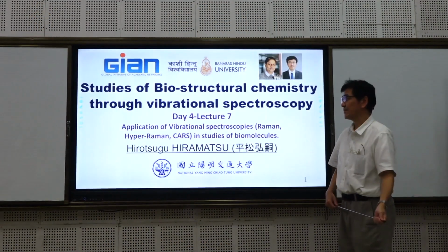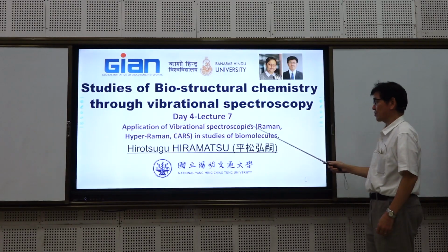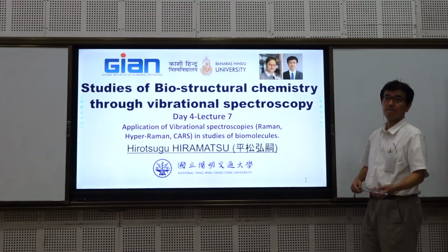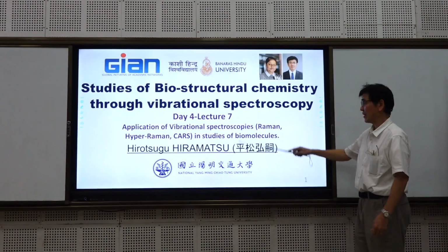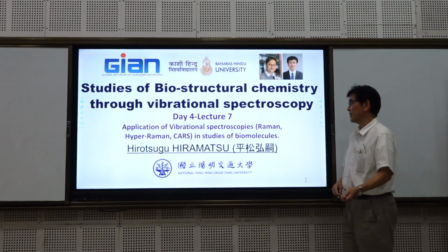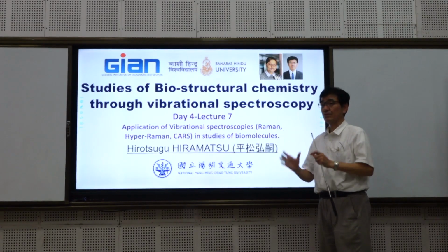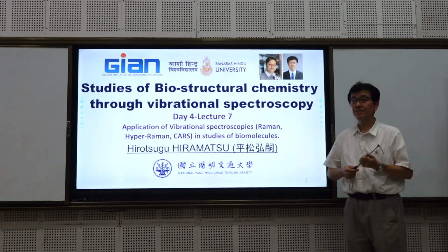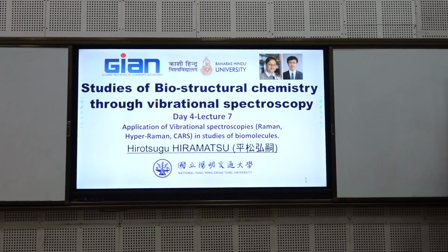Then let's start today's lecture. The title is Application of Vibrational Spectroscopy, Raman and Hyper-Raman, in Studies of Biomolecules. Yesterday, we ran some examples about the studies on small molecules. Today, we change the focus to biomolecules. What is the difference? Molecular weight.